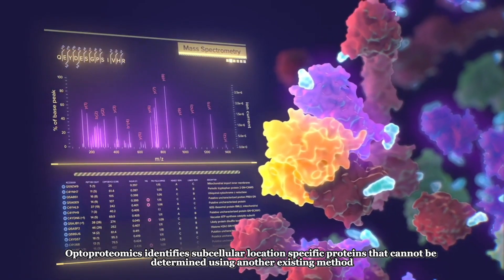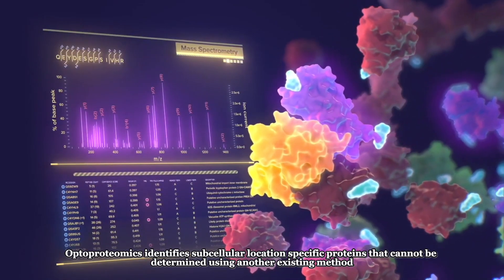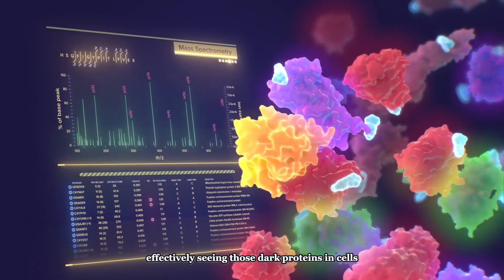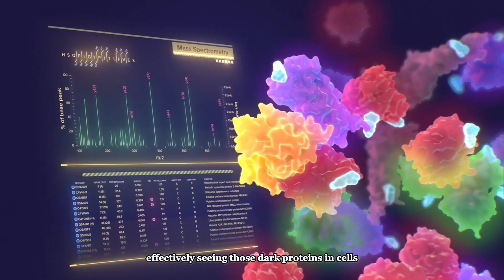Optoproteomics identifies subcellular location-specific proteins that cannot be determined using another existing method, effectively seeing those dark proteins in cells.